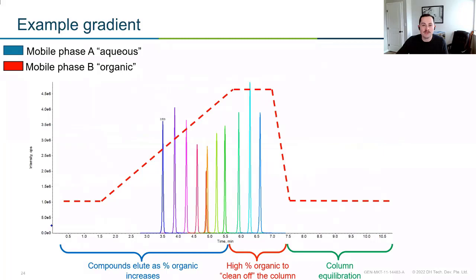So we've chosen our mobile phase. We're just going to go generic again. Now it's time to sort of use that chromatography and get our method to meet our standards and the things we need to accomplish. So we talked about this a little bit last time, so I won't go too far into it, but we essentially have these 4 stages in our chromatogram. We have an aqueous stage where we're letting our more polar things elute.